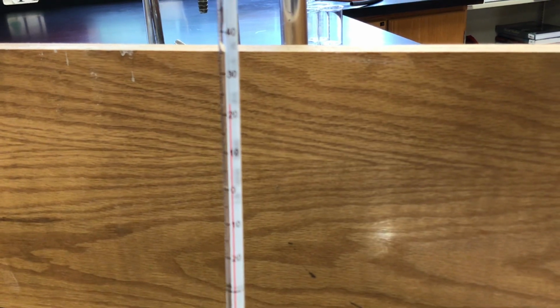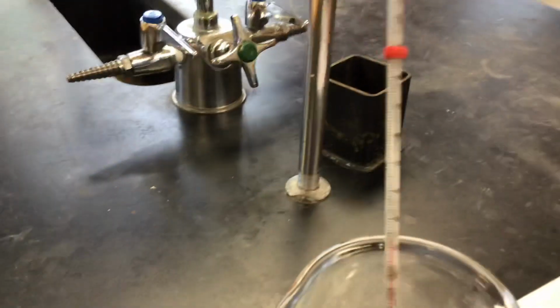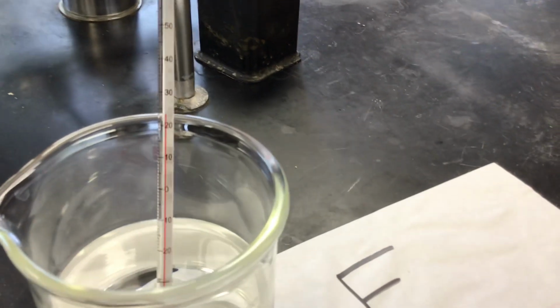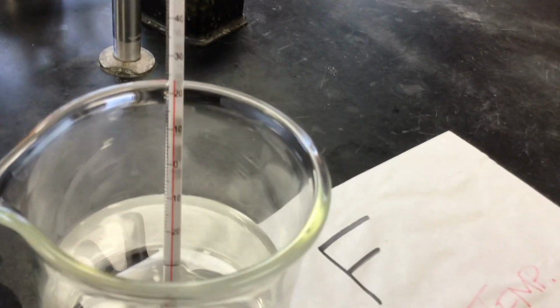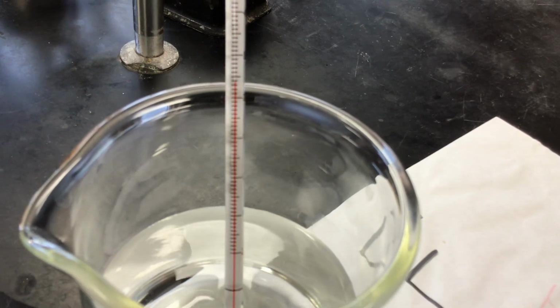Boy, it's not focusing very well. It's focusing on the wood more than the thermometer. Let me move the wood. Maybe I should get rid of the wood. See if that makes a difference. Oh yeah, I think maybe we can catch it like this. That does help. So we can see it's between 20 and 30 now. Can we read the temperature?